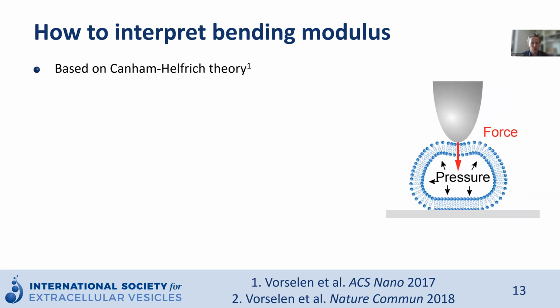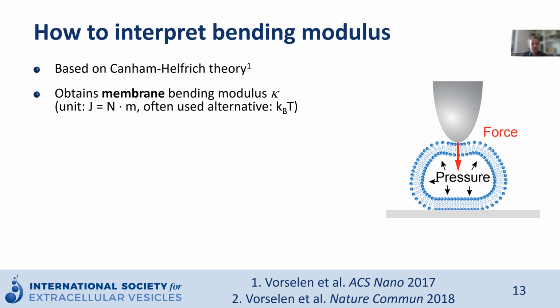Finally, a different model for describing vesicle mechanics has been introduced by myself and colleagues. This one is based on Canham-Helfrich theory for fluid membranes. So unlike these other models, it doesn't derive a Young's modulus, but a bending modulus, a measure for the bending resistance unique to membranes.